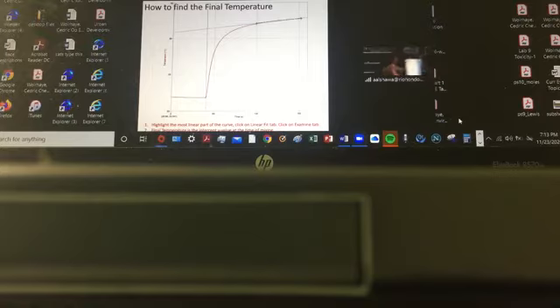That's always the tendency of these containers with the stuff inside, and that feature is going to be shown later on. So I'm going to track that feature of decreasing temperature. I want to extrapolate using the plot back to the initial time of mixing, assuming here's the kink between the initial temperature and when some activity occurred. At the initial time of mixing, the intercept of that vertical line with the line drawn from the straight line of the later section of that curve is going to give me the final temperature. So that intercept point is my final temperature. Let me explain to you how to do it.